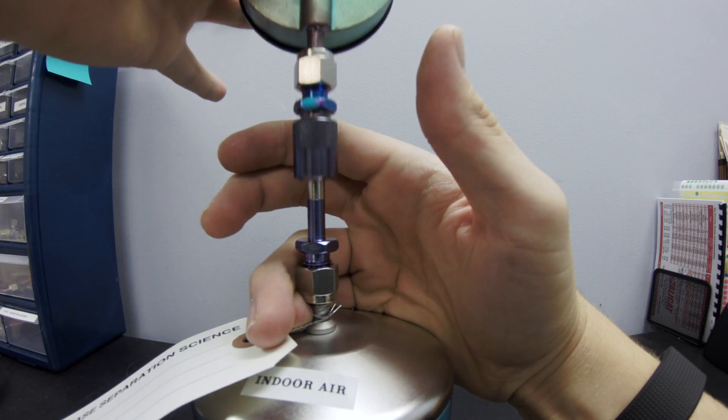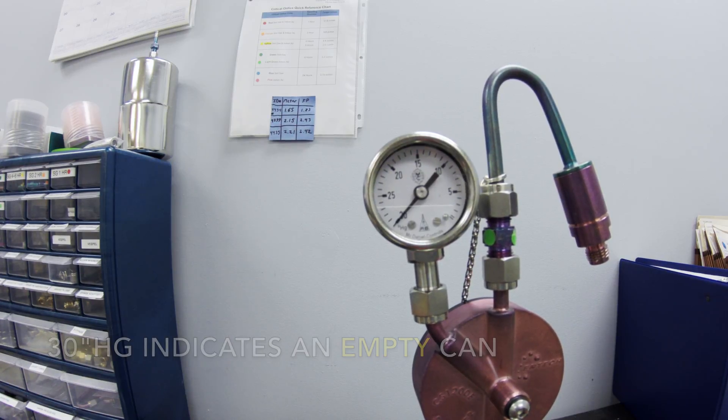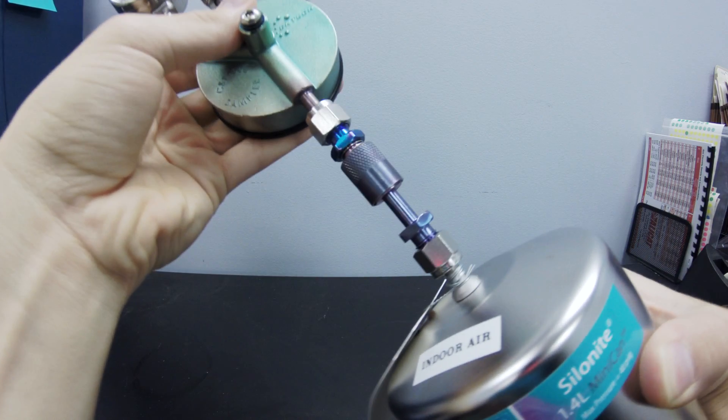After you click the flow controller down onto the can, you'll notice that the gauge moves to 30 inches of mercury, indicating an empty can. Afterwards, verify that the connector is fully engaged to the can.